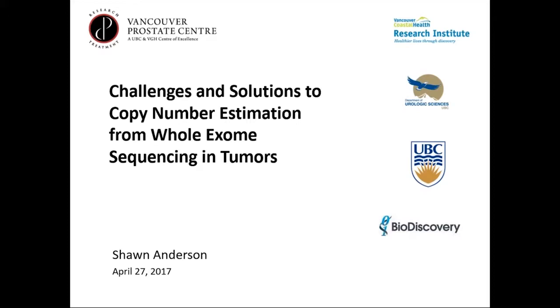Sean? Okay, thank you very much for the introduction, and also thanks to BioDiscovery for letting me get an advanced version of Nexus 9 to evaluate. It was really useful, and I wanted to show how the multiscale reference tool especially was incredibly helpful. So today I'm just going to talk about some of the challenges and solutions to copy number estimation from whole exome sequencing in tumors.